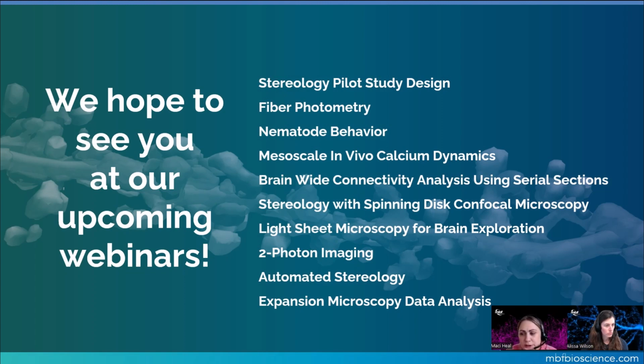There's a question about how the software handles detection of multiple dendrites branching off a soma. This one was very simple, where we saw single branches emanating from the soma. But we handled that a little uniquely, where the somas are distinct objects from the trees or the vessels or the puncta or the spines. And that allows you to do a robust set of analysis. But it also means you can have branching structures or more than one tree emanating from a soma at a given time. The software doesn't make any discrimination one way or the other.